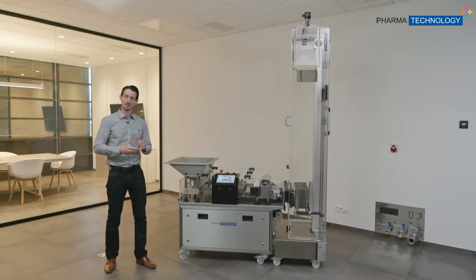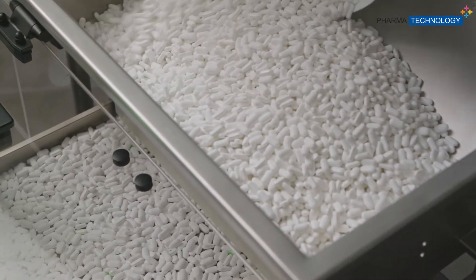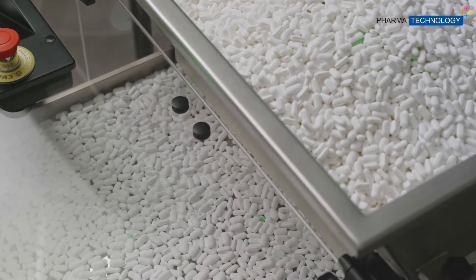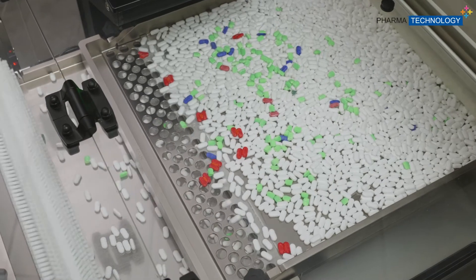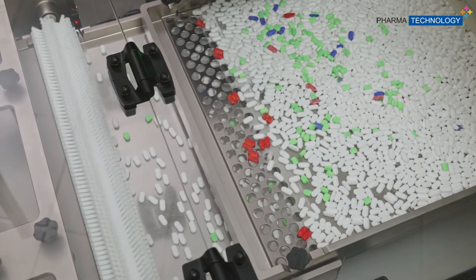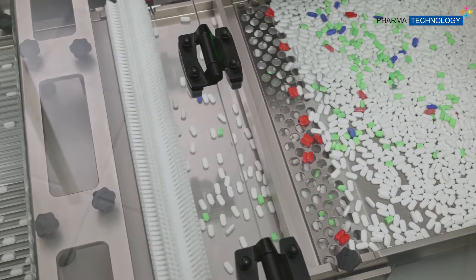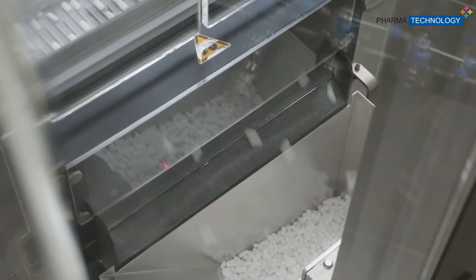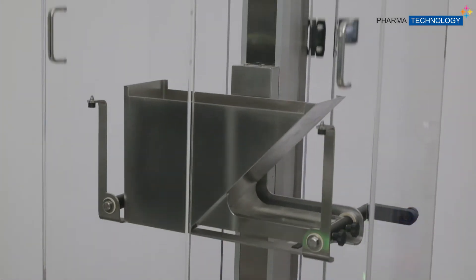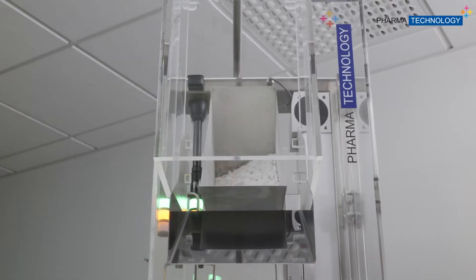Let's go over the process of this machine. First of all, you enter the machine in bulk on this side. Then we go to the pre-feeder, making sure that we spread the tablets between each other, and we go to the station for the sorting of twin tablets. We then go to the sorting table, where we have the roof system and the sorting of broken tablets and capped tablets. Then we exit the iSort and enter the iLift in the bucket. When the bucket is full, it goes up in order to reach the higher position to feed your blistering line or bottling line.